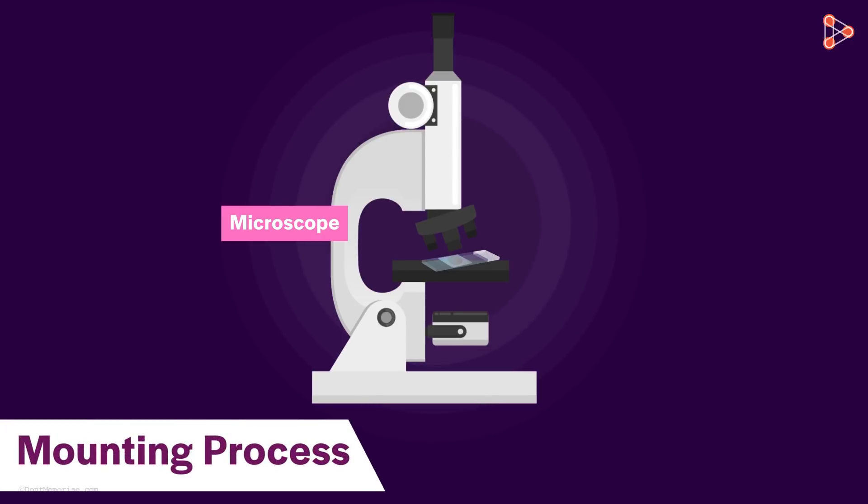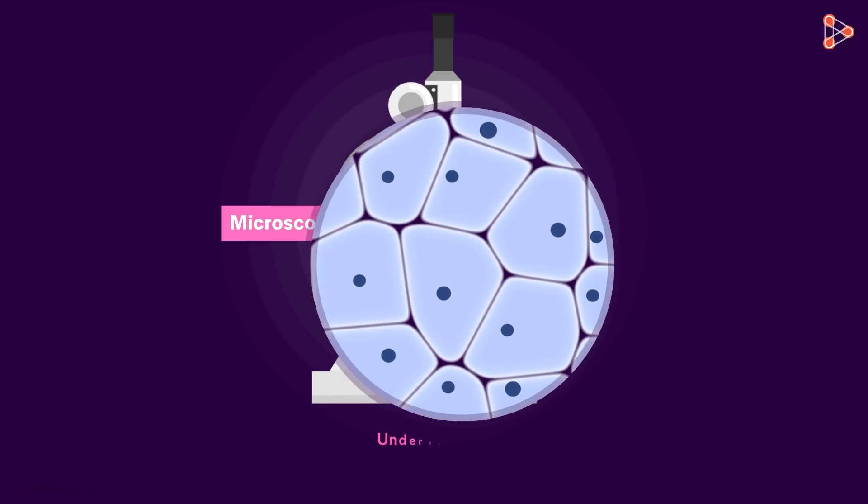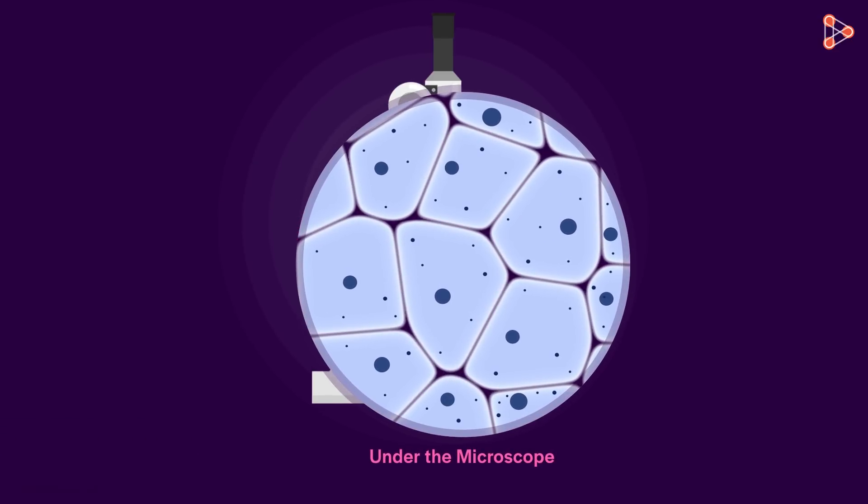It is also important to see that there is enough light falling on the mirror of the microscope. Shall we observe it now? Here we go! Wow! Doesn't it look amazing?